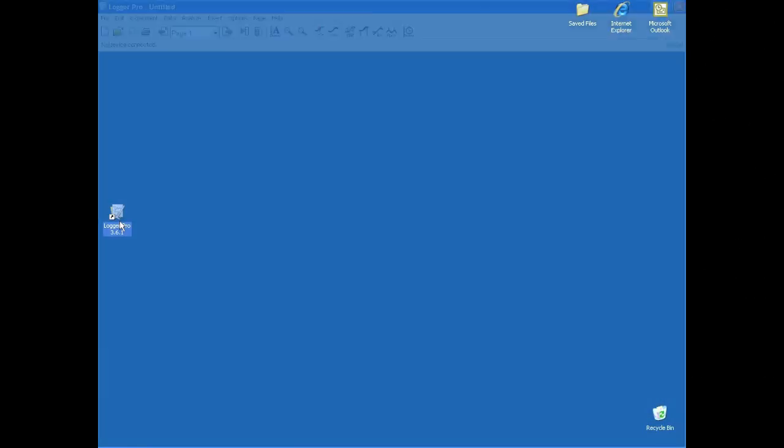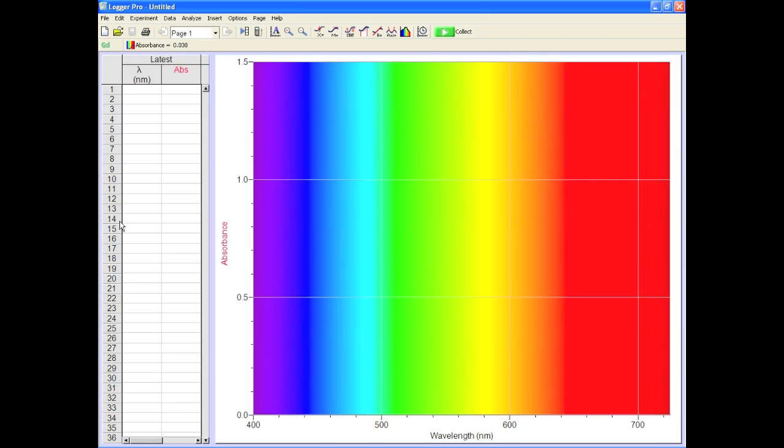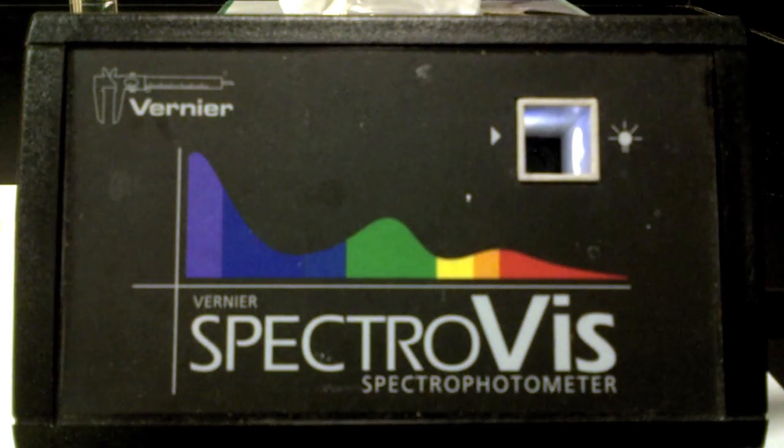Open Logger Pro. See how the screen changes as it recognizes the instrument. Check out the spec as well, notice it's lit up. Perfect.